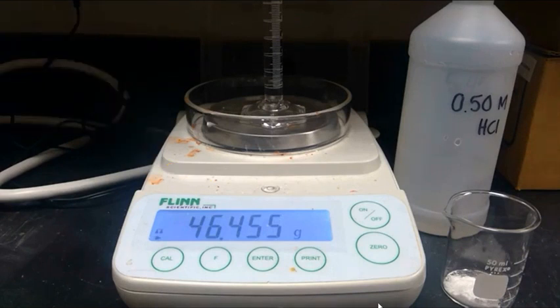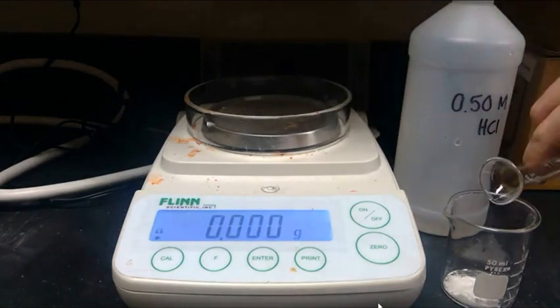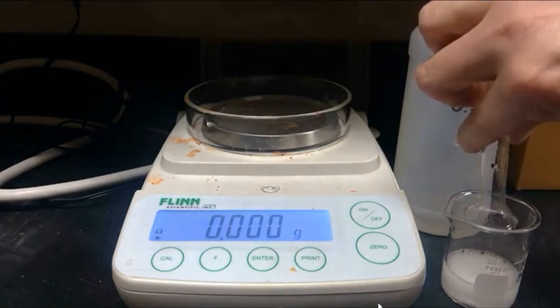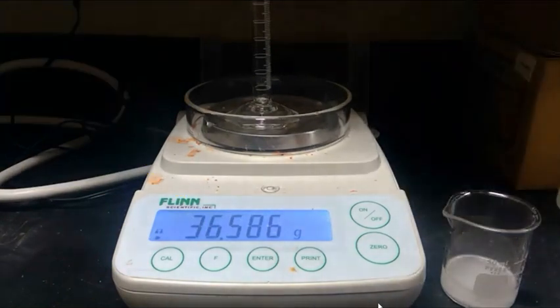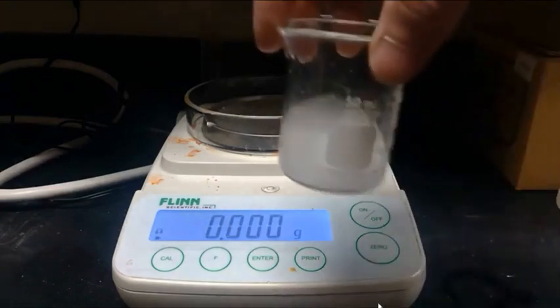And now we'll slowly and carefully react the hydrochloric acid with the baking soda, making sure that we control the rate at which that reaction happens so we don't lose any of our product. And then we're going to measure the mass of the empty graduated cylinder. From the last 2 measurements, we can now figure out the exact mass of hydrochloric acid that went into the beaker.